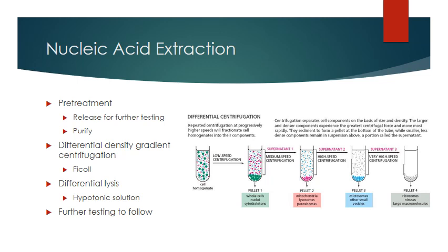Another process is differential lysis, where you have that difference I talked about in the osmotic fragility between the red and white cells. And what you do in that case, if you wanted to do that, is you use hypotonic buffers, including water. Water would work as well, which will lyse the red blood cells before the white blood cells. Then you gather the white blood cells.